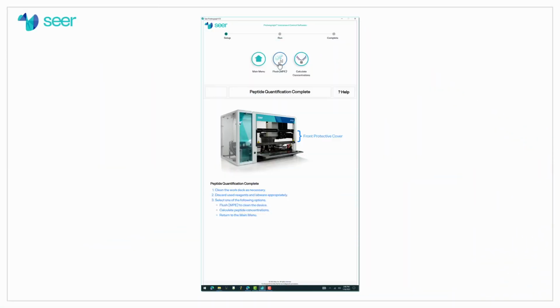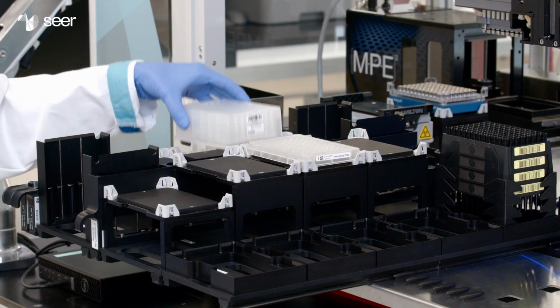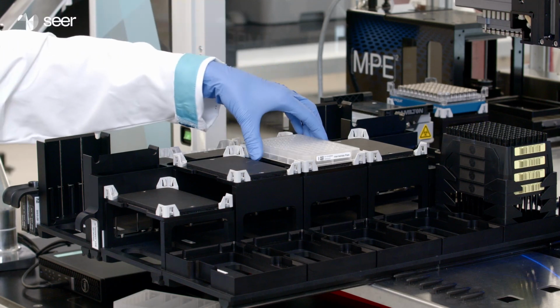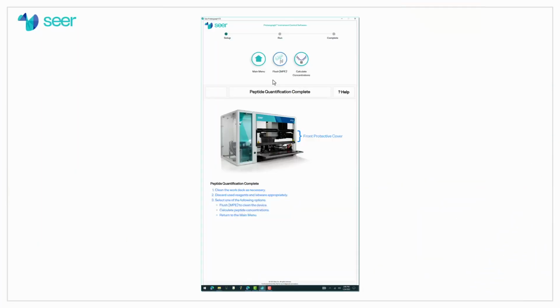At the peptide quantification complete stage, unload all other labware from the work deck. Discard used labware and reagents appropriately. Select one or more of the following options. Select Main Menu to return to the ICS main menu. Select Flush MPE to run the MPE Flush maintenance method.